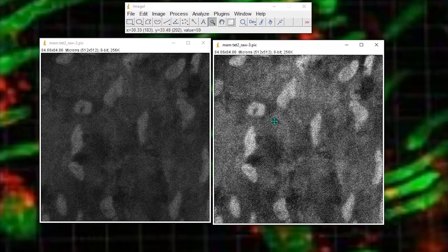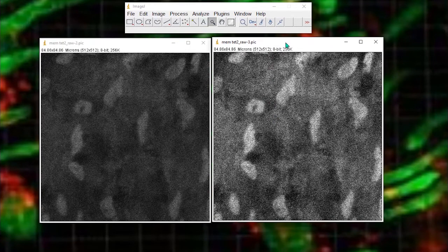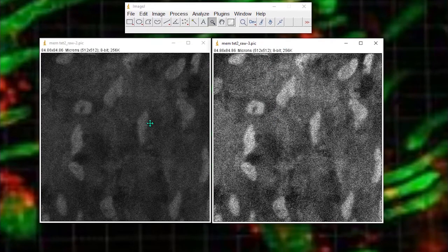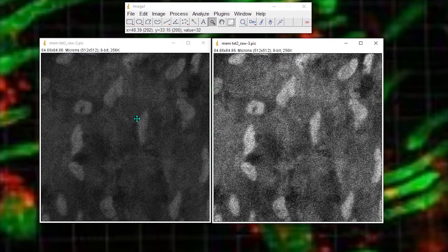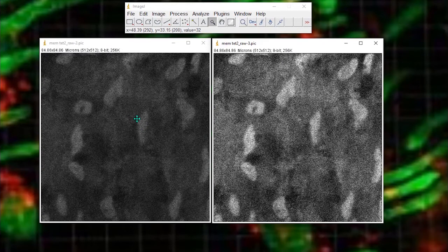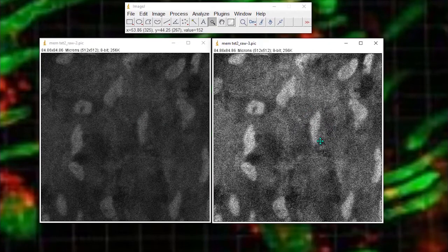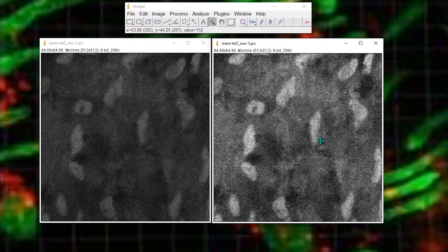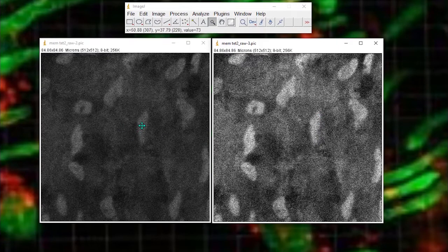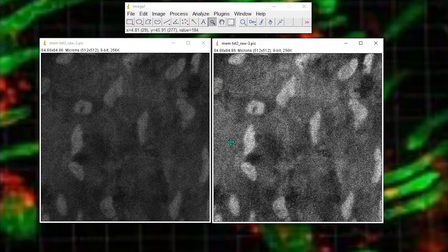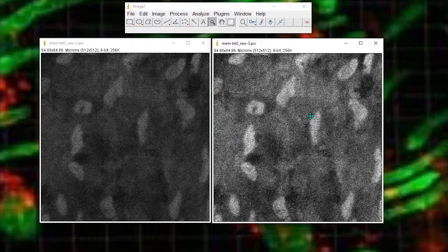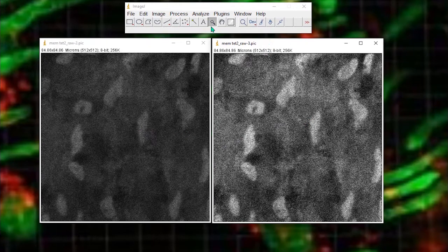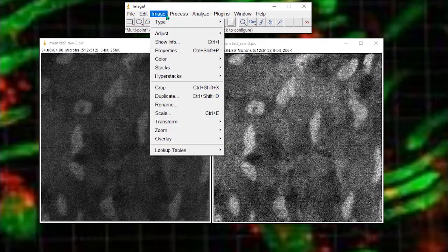But remember that if you are measuring intensity in an image, if these were cells expressing some kind of something, you would not want to now be measuring this image because you have changed the values. That's very important. But we can use this image to extract information from this image. So we will use the enhanced image and we will threshold it.